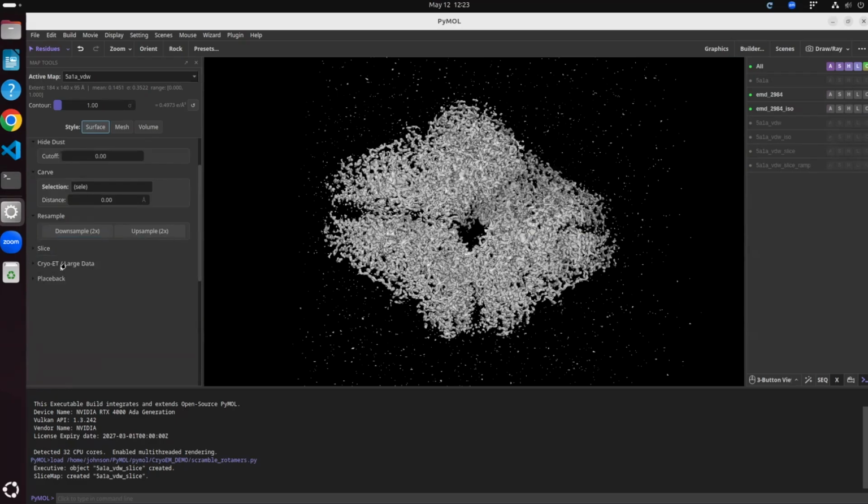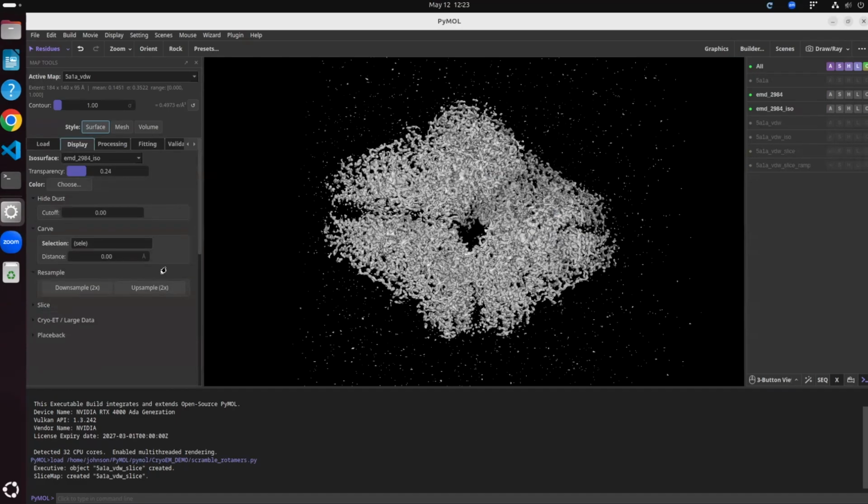Jarrett, could I interrupt you with a brief question, or I guess hopefully brief? Could you say a little bit about the current state of map handling that you're talking about? Does this do any symmetry transformations or translations or centering, or is this just displaying what's loaded in the map, versus taking what's in the map and then trying to update it to where the model is or where the view is? More of the latter.